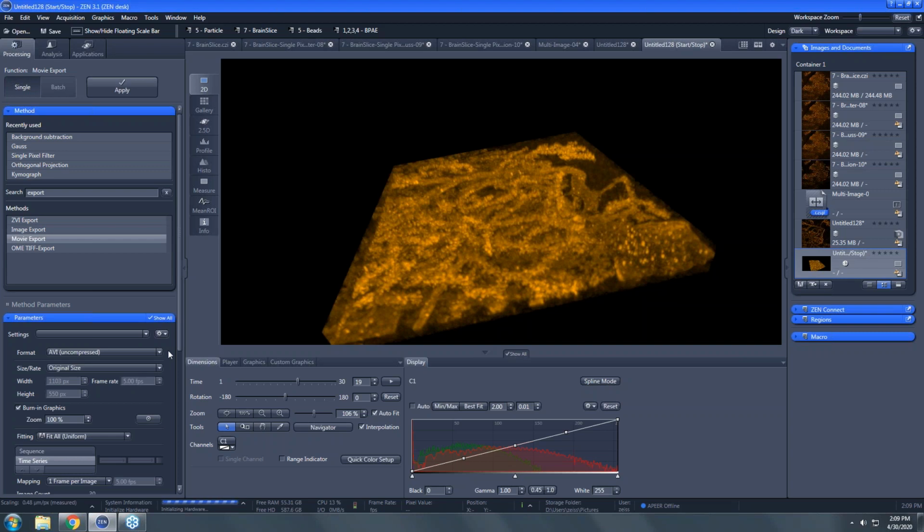All right. I should say that we're going to end at about, I would say, 225 based on experience from doing the image analysis. So all we have left is to run through image analysis, and we're going to count some nuclei. And if people have to run because they've got somebody barking or yelling from another room, then thank you for joining us. But if you can stick with us for just a bit longer, we'll show you some neat stuff that is the automated image analysis module, right?